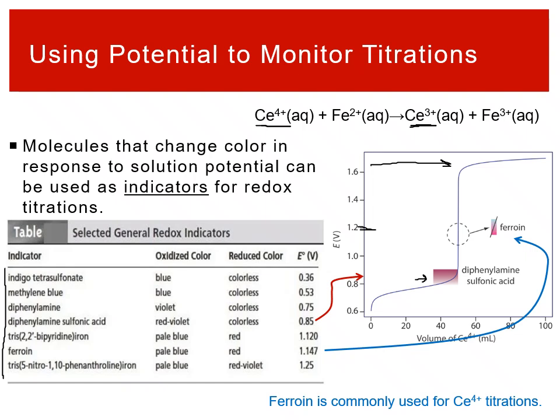And again, this is one of those things where I'm not expecting you to memorize how to do these things or these levels, just to know that doing redox titration is a bit more complicated than acid-base titration. There are a bit more factors to it. There's also more flexibility. So you have to figure out more things, but you have more flexibility. What are you dealing with? What's the best strategy? Are you going to do one of these indirect analyses? You're going to do a direct analysis.